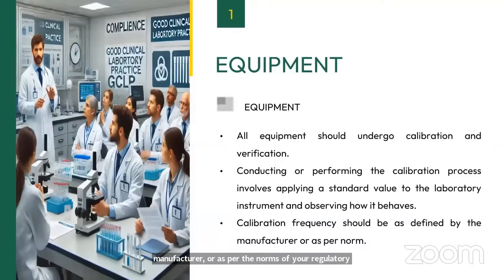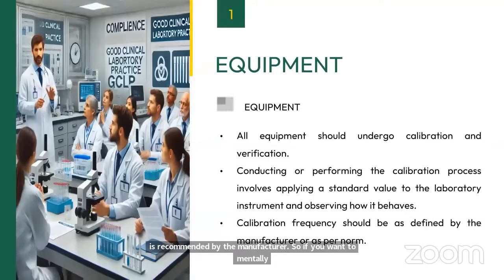So again, you should not change, as far as possible, this calibration and maintenance frequency. It should not be changed by the laboratory. Whatever is recommended by the manufacturer, if you want to maintain the equipment in good working condition, you should follow whatever is mentioned by the manufacturer.